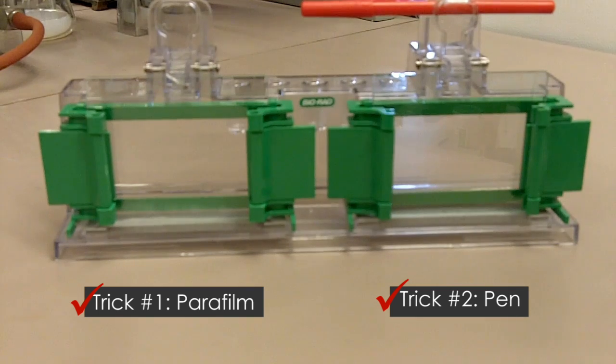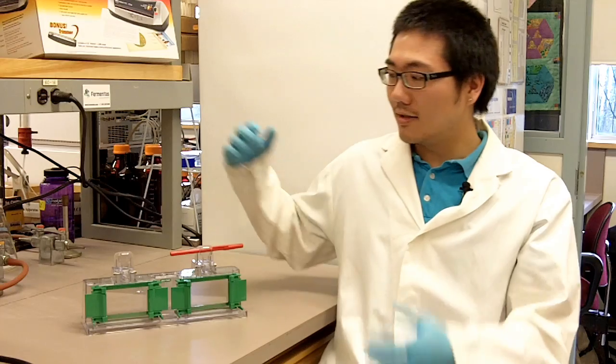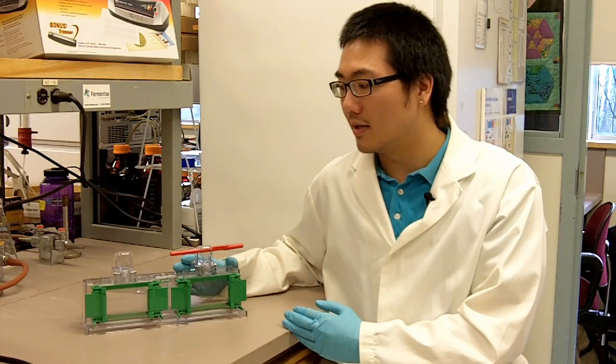You can use these two tricks separately or you can combine them. And it's all up to you. So here are the two tricks on how to prevent the gel from leaking. The first one using the parafilm. The second one using a pen.